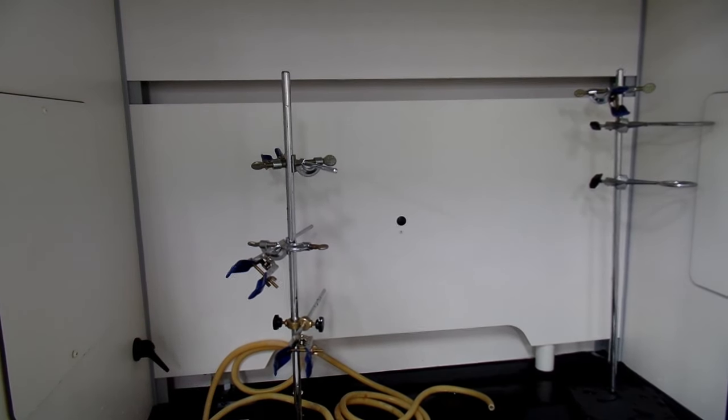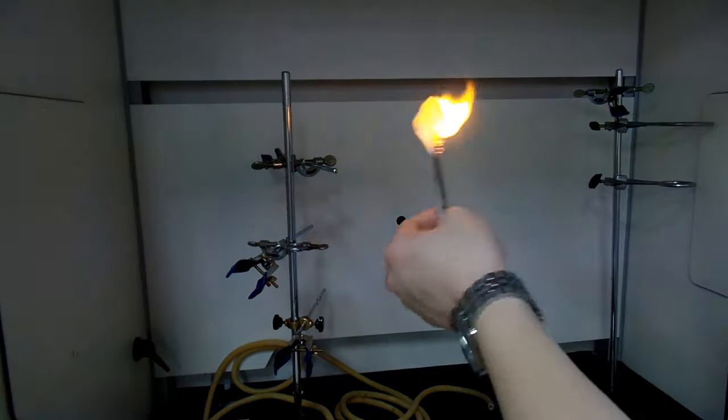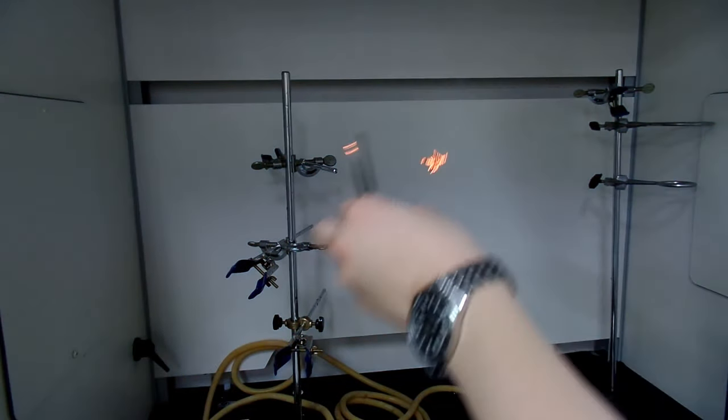Nitrocellulose is used in magic shows, the film industry, or making ping pong balls. It is extremely flammable, and when you fire it off, all the nitrocellulose will convert to gas, leaving no residue if the nitration of the hydroxy groups is complete.